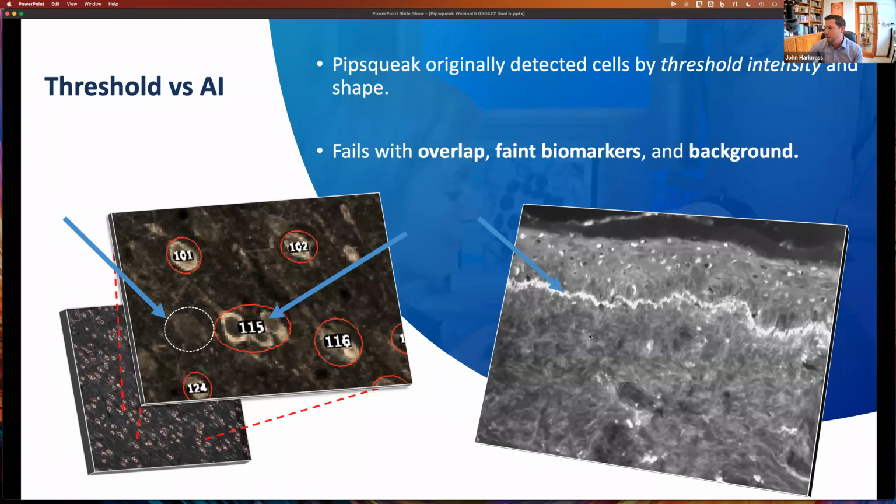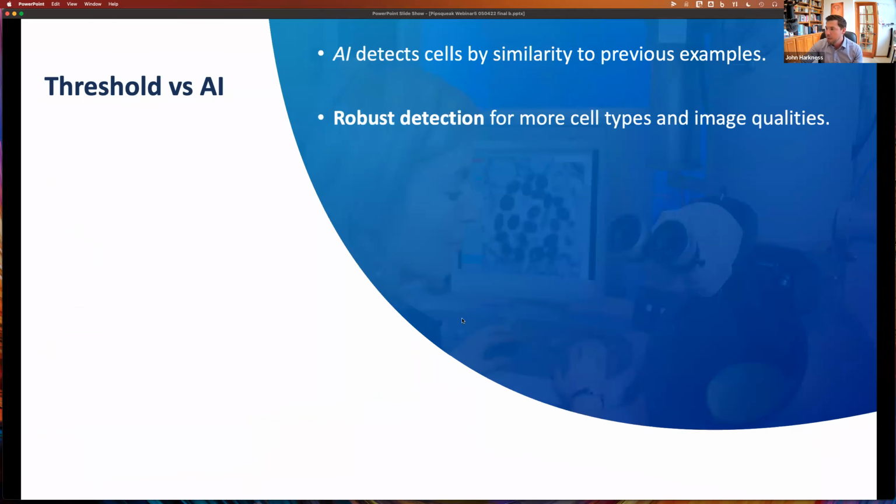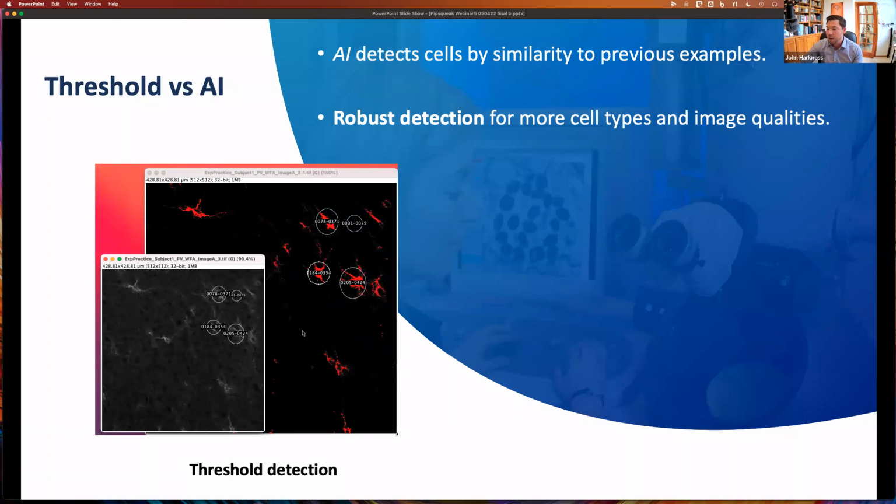So, this was a nice approach for us, but it really didn't prove that fruitful. And so we moved towards an object detection based computer vision approach. The reason that we did that is because I think there are a lot of examples of morphologies that really don't fit well into segmentation approaches.